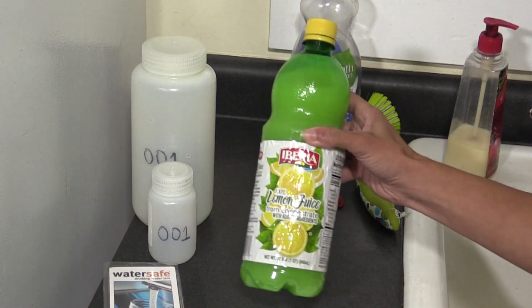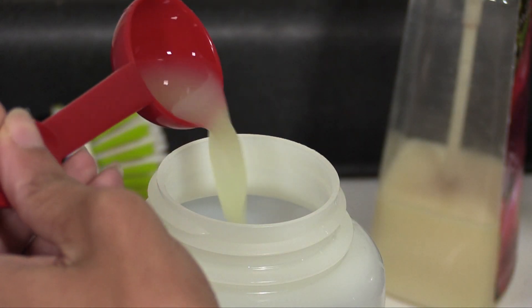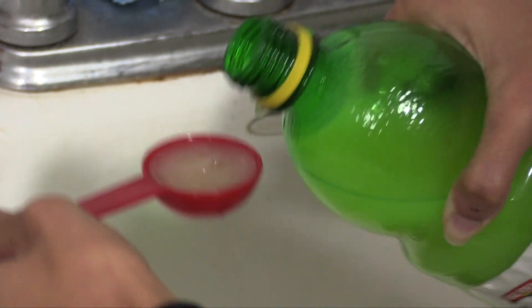You'll also need some lemon juice or white vinegar. Measure out three tablespoons and put them in the large bottle before collecting your water sample.